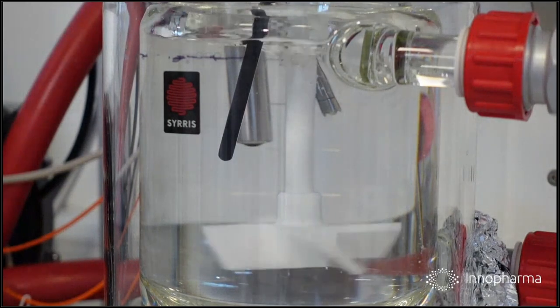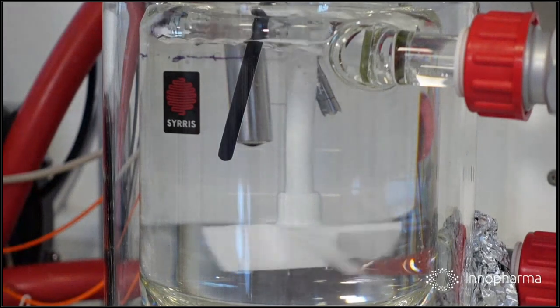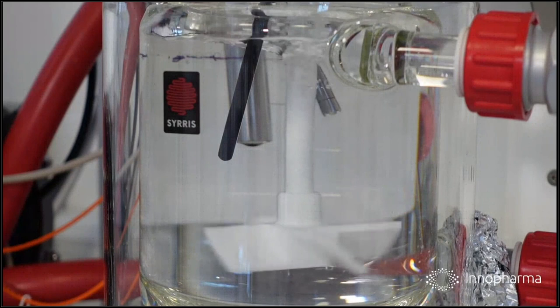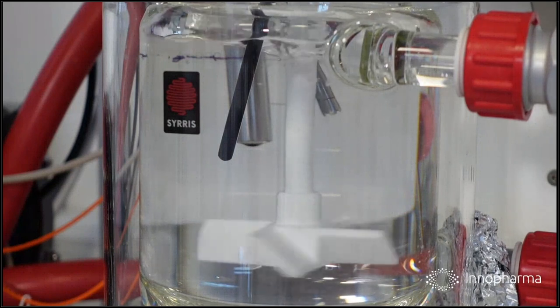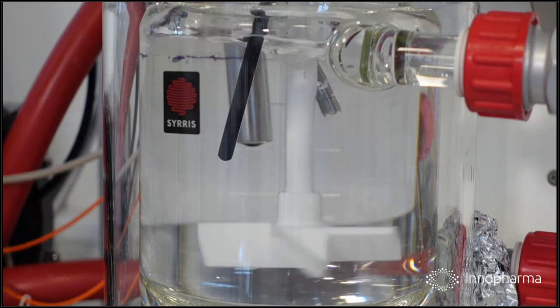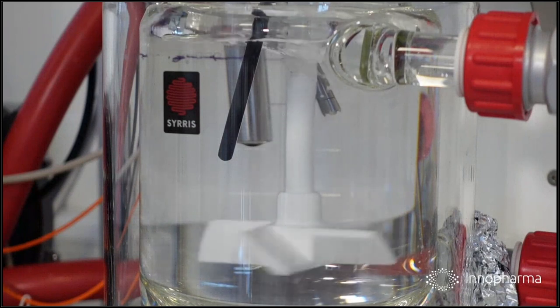So when we're monitoring this, we could start monitoring all of the different concentrations of all of the elements present, or we could just keep monitoring until changes slow down and stop. Another example is the fermentation in beer or cider production. The trend is more important than the accuracy of the degree of fermentation.